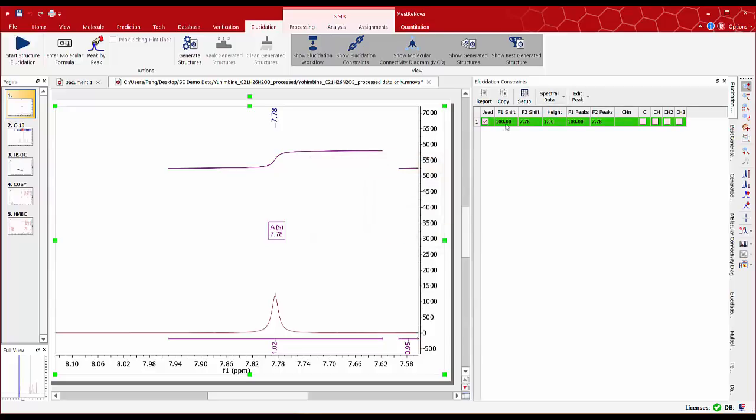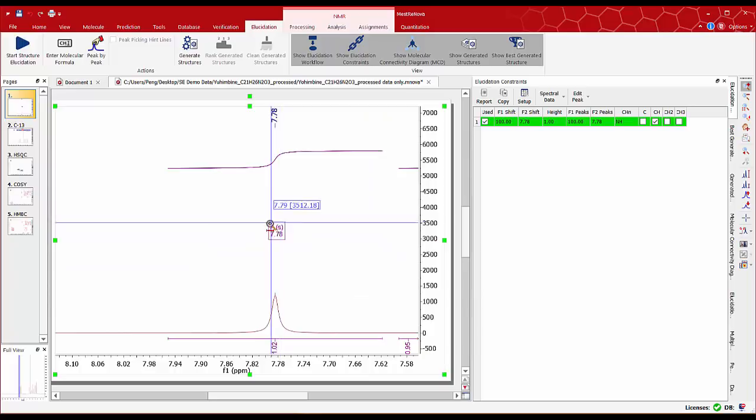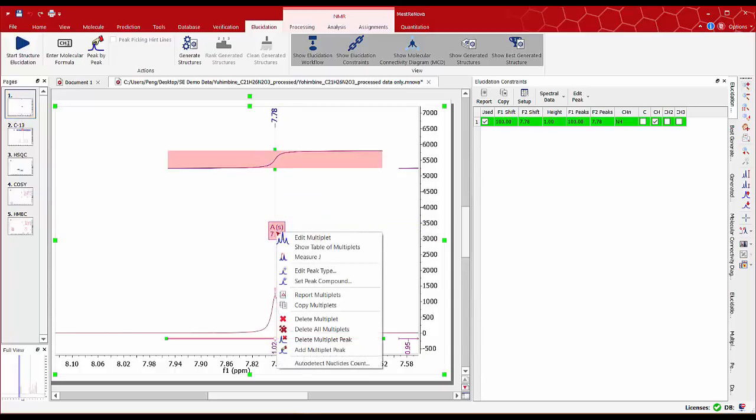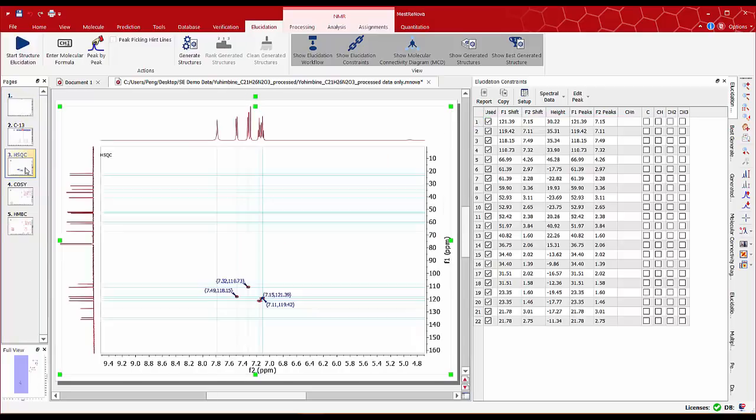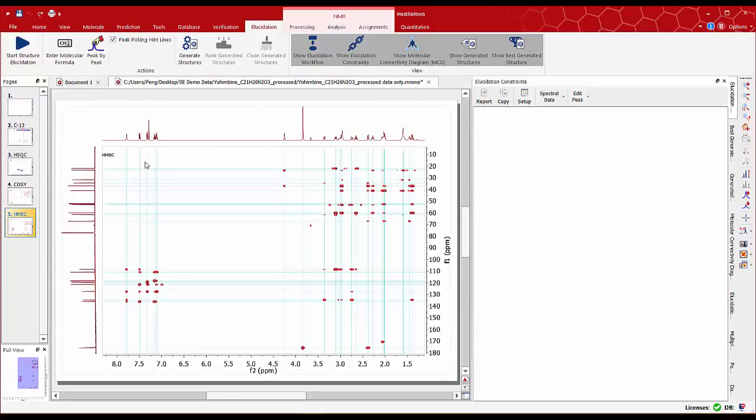The elucidation constraint table shows the row in green for this proton. We can tick the box corresponding to the group with one proton. To avoid confusion it is important to delete this multiplet at 7.78 ppm from the 1D spectrum. Otherwise we may obtain two chemical shifts for this group on the HSQC and HMBC spectra which can cause problems with the structures generation.